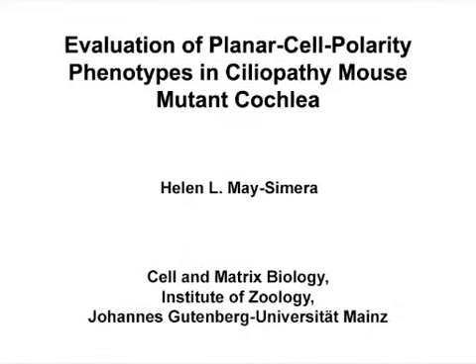The overall goal of this protocol is to examine ciliary mutant mouse cochlea for planar-cell-polarity phenotypes. These techniques allow for an extensive detailing of the cochlear phenotype, which will lead to a more precise understanding of the ciliary involvement in establishing vertebrate PCP signaling.